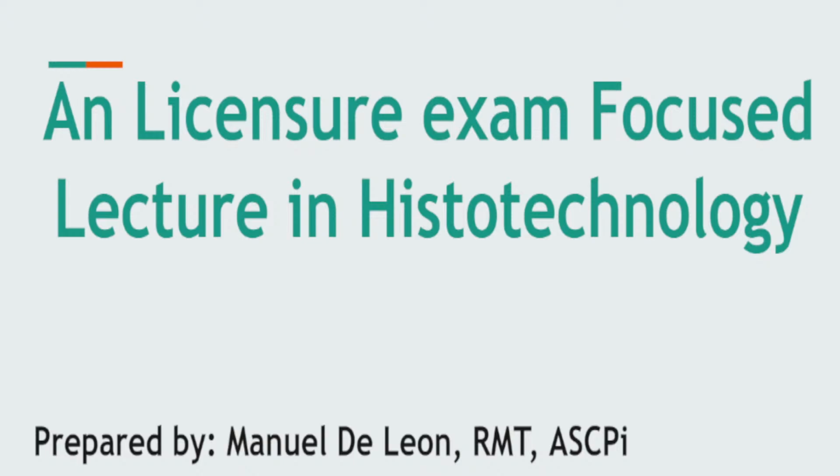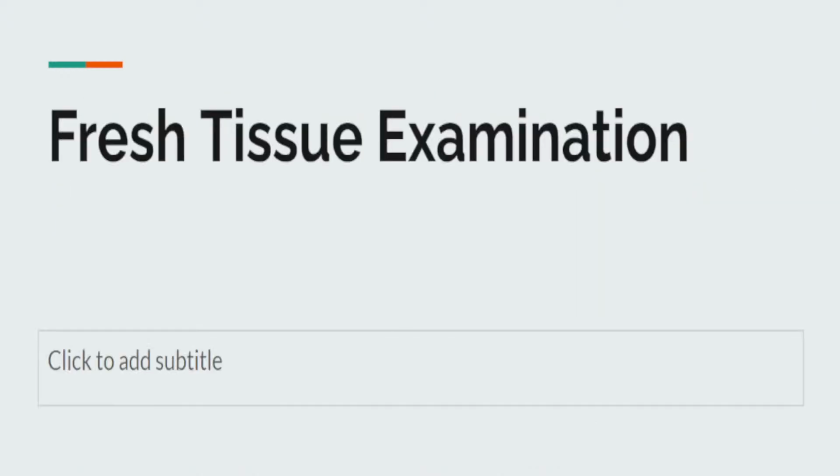Okay, so a licensure exam focused lecture in histotechnology. Here we go. What do we want to learn first? When we're studying histotechnology, we don't want to be focused more on the pathology, but more on what we do as medical technologists in the Philippines, or medical laboratory scientists. So, first thing that you need to remember is, of course, we have to study fresh tissues. This includes your gross examination.